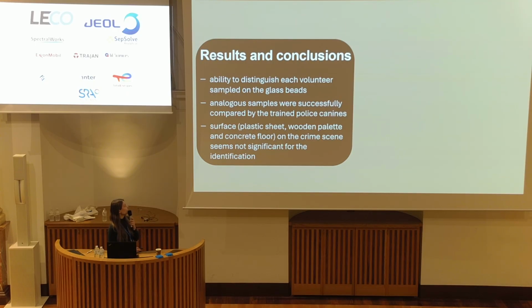So in conclusion, we've shown the ability to distinguish each volunteer on the glass beads, and we were able to find the shooter by police-trained canines. And the surface from which we're collecting the unknown samples doesn't seem to play a significant role for the identification, which is a good thing.